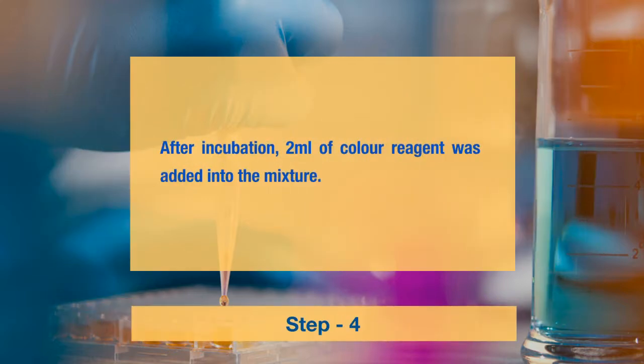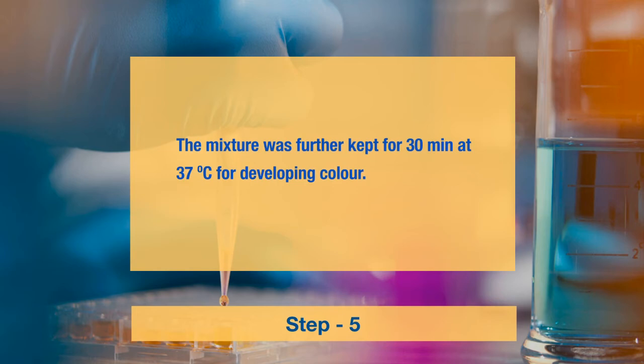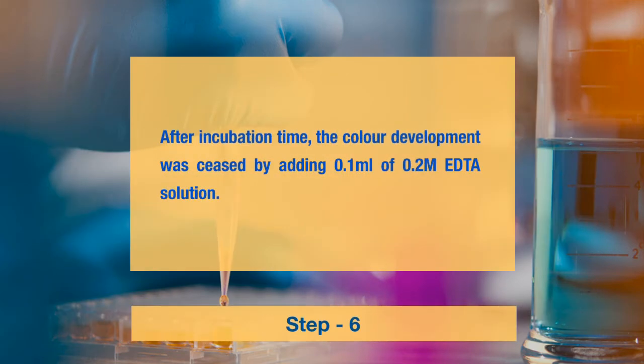In the next step, after incubation, 2 ml of color reagent was added into the mixture. Next, the mixture was further kept for 30 minutes at 37 degrees Celsius for developing color. In the next step, after incubation time, the color development was ceased by adding 0.1 ml of 0.2 molar EDTA solution.